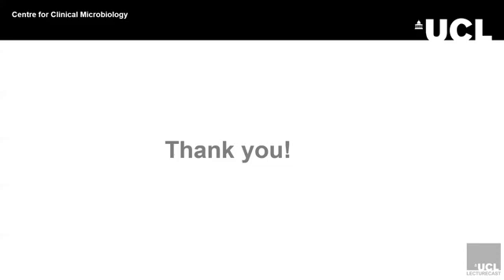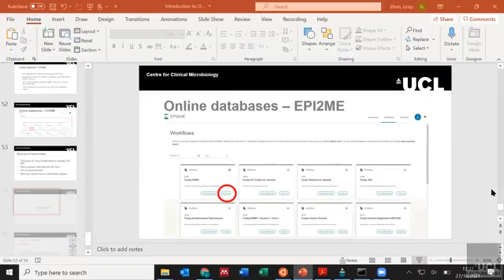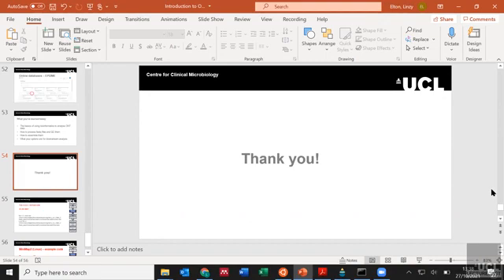I have another question if no one else does. Sure. Have you had experience with concatenating Fastq files? Because sometimes Illumina will give you read 1, 2 or whatever. Yes. What's that like? Is it difficult? So I used, and a colleague will be able to tell you because he and I did it together. I forget what the code was, but it's a fairly simple, just Ubuntu based, or it might even be Windows. I can't remember off the top of my head.